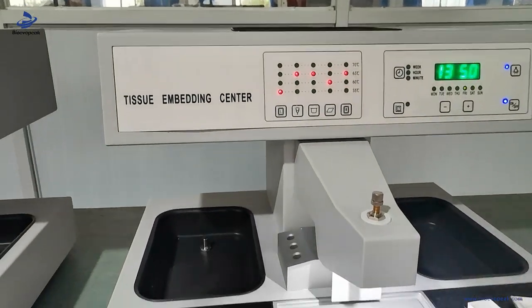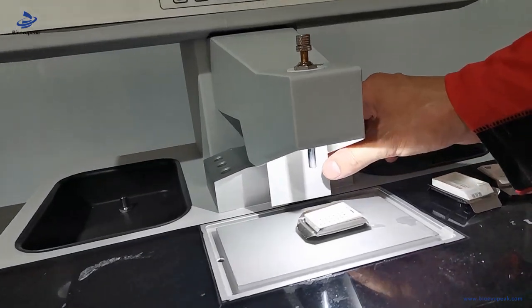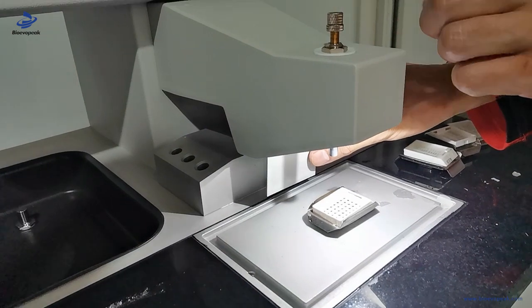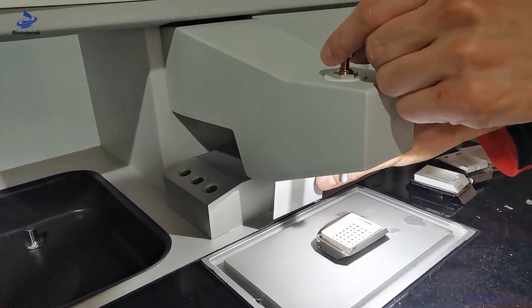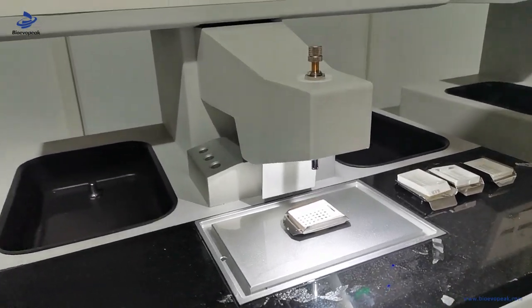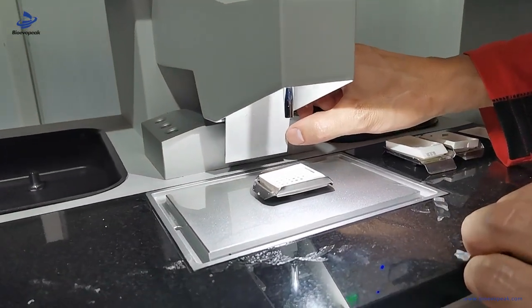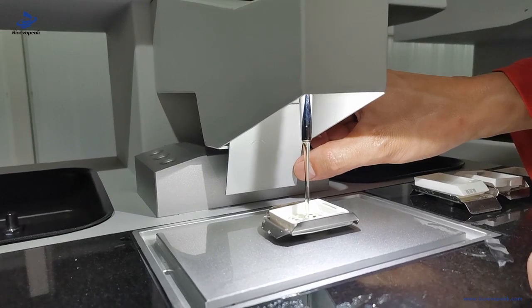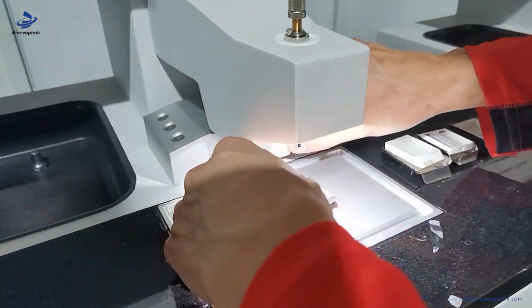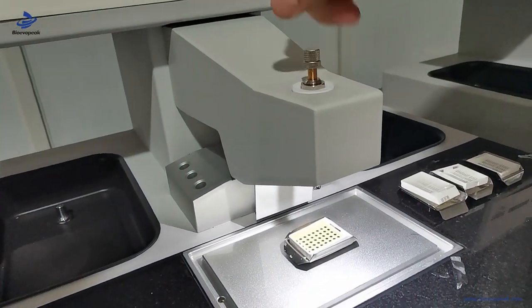When the paraffin block in the paraffin station has melted, we can start to make the embedding for the paraffin cassette. Press this button and the liquid will flow out into the embedding cassette. This knob is used to adjust the paraffin flowing speed.